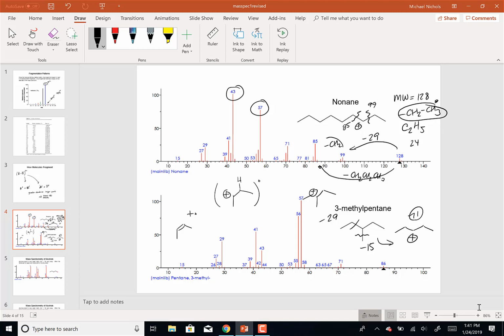So that's 4 carbons, which is 48, plus that would be 9 more hydrogens. So if I'm drawing this, I've got 1, 2, 3, 4. So that's 48. And I'll mess that up at least once this afternoon. But it's 48 plus then 3, because when I broke that bond, there was only 1 hydrogen there, so that's 3, 4, 5, 6, plus 3 more.